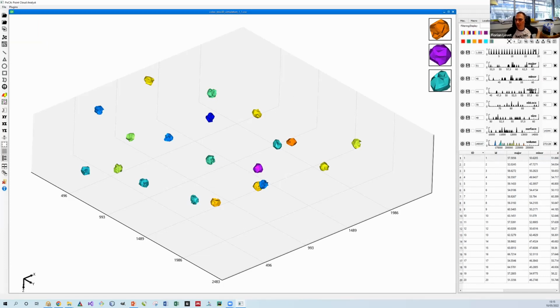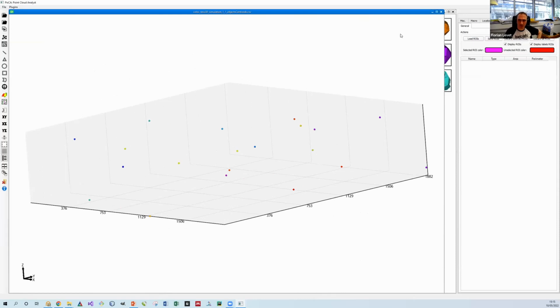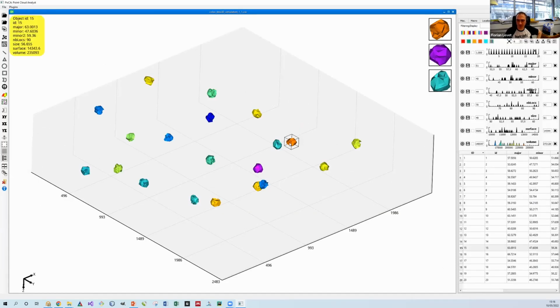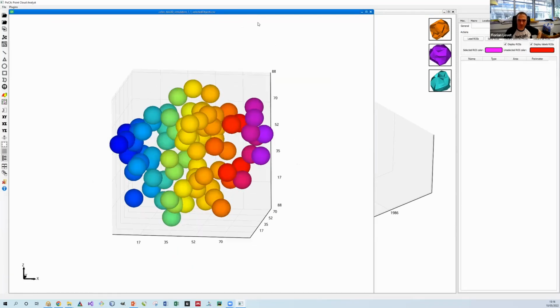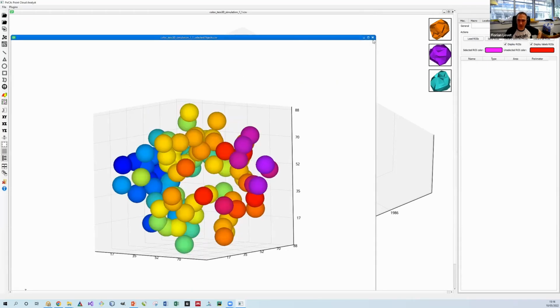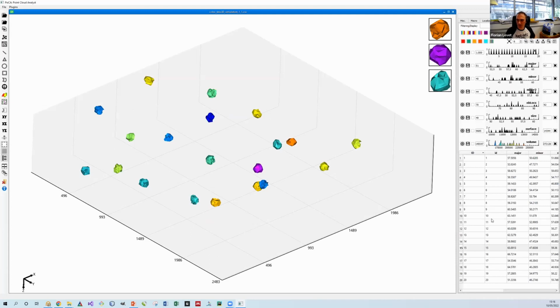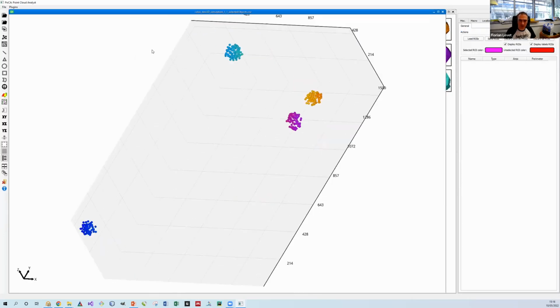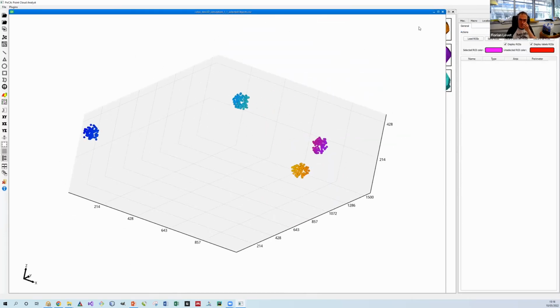And here you have a few things, like you can duplicate the centroids of your object. So in this case, it would give you that. You can select some objects and duplicate the localization of these objects. In this case, I had only one object selected. But if I select a few, like that, and I duplicate them, it will duplicate the full selection.